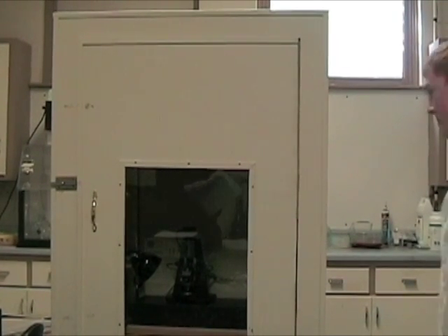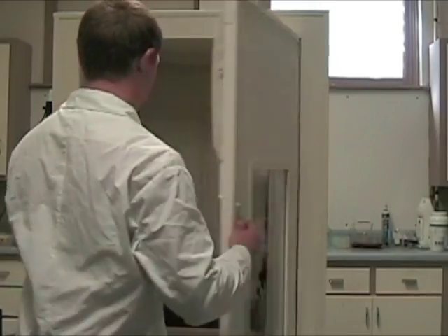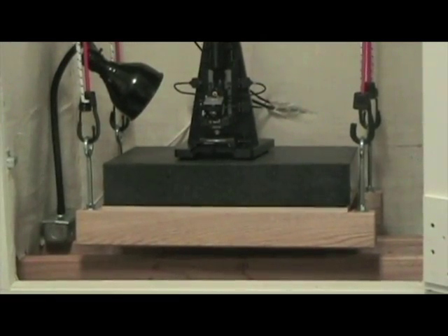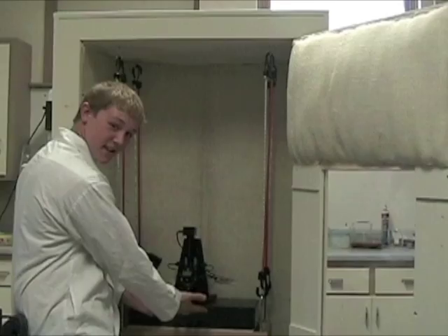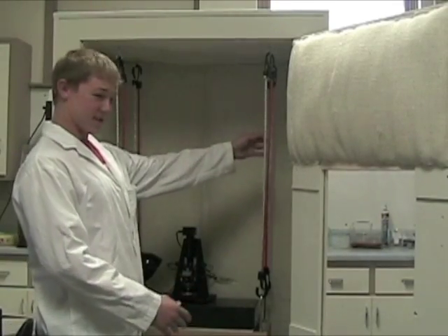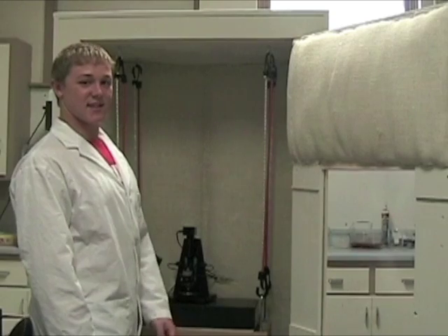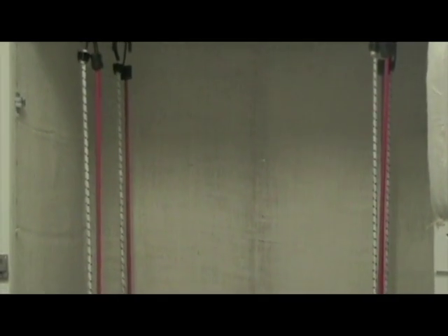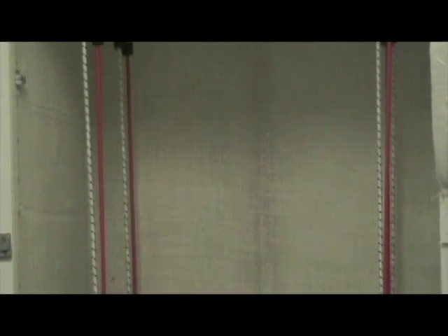Here we have an AFM, otherwise known as an atomic force microscope. Notice that the microscope is mounted on a heavy platform, which is suspended by bungee cords to help reduce the interference of vibrations. Then there is cushy padding all around the inside walls of the box to help reduce sound vibrations.